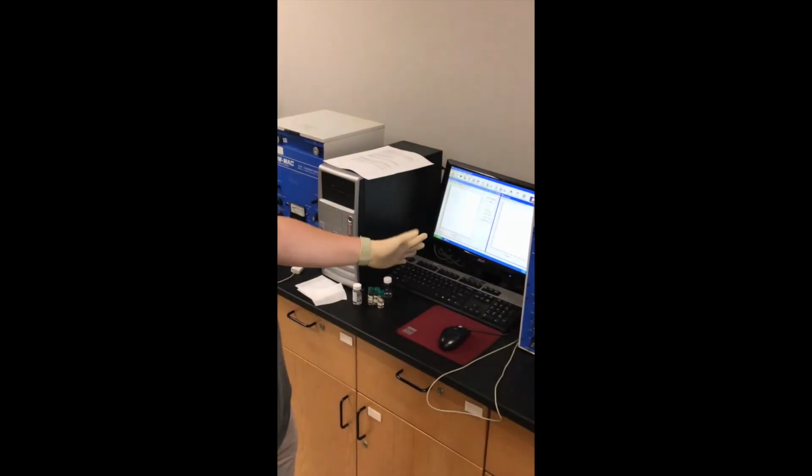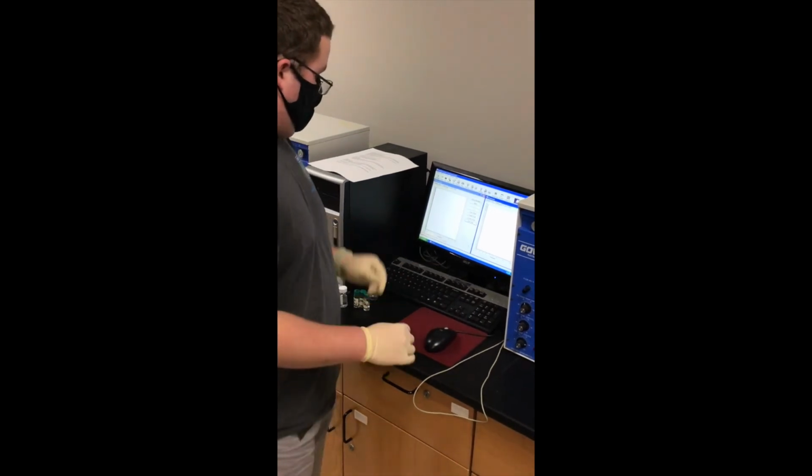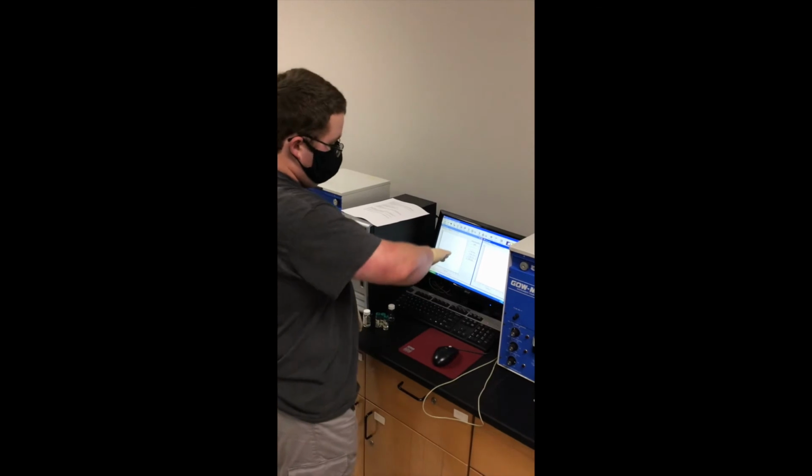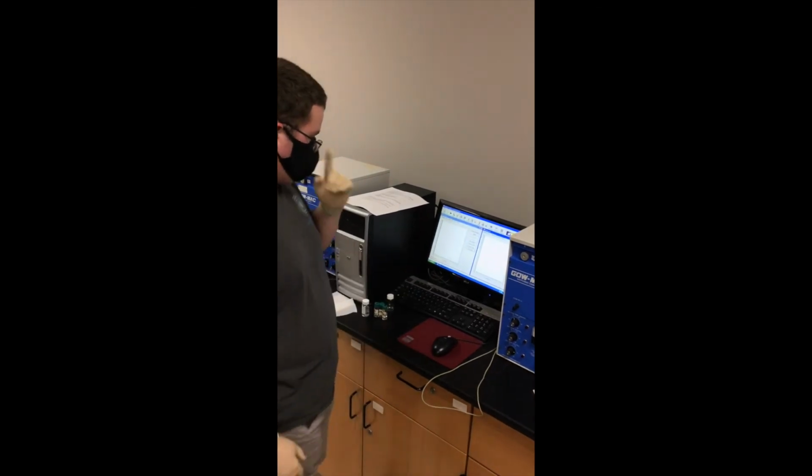And so this will automatically start taking your information. If you've got any components in there, assuming that your syringe is not clogged, it will start to go through, and you will see some results coming up on the screen.